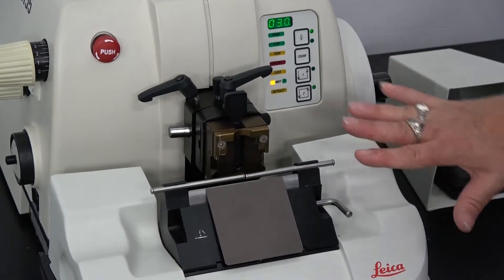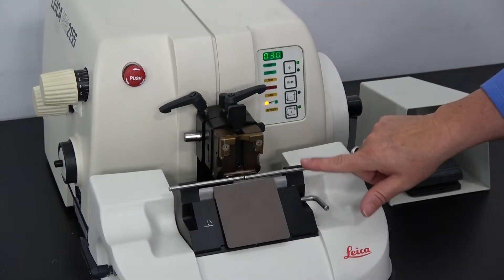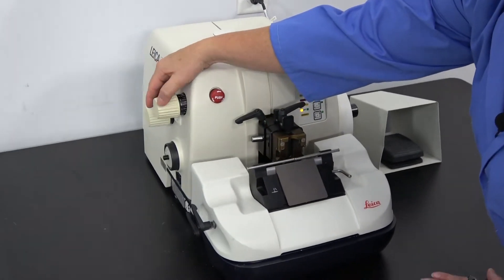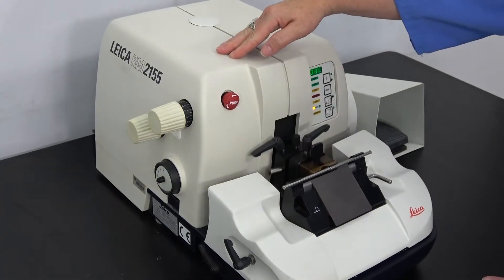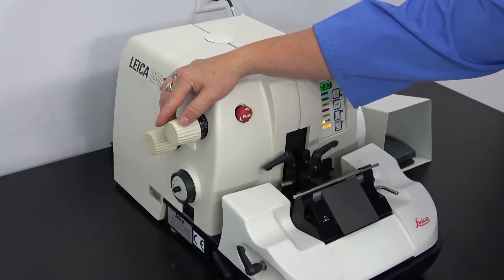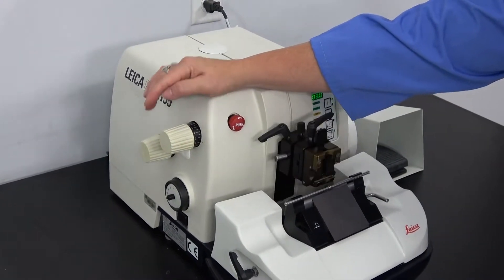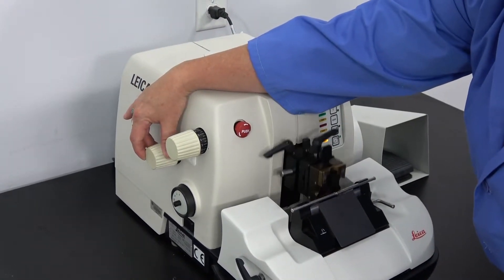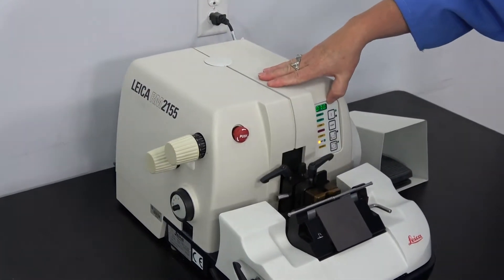This particular microtome comes with all of the parts so it is a complete unit, except of course there is no knife in it. Over here is where you set the speed for the sectioning. You can go much faster or much slower depending on how fast you want to get your tissue samples off. This knob sets the thickness of the tissue sample, which is reflected here in the digital readout.